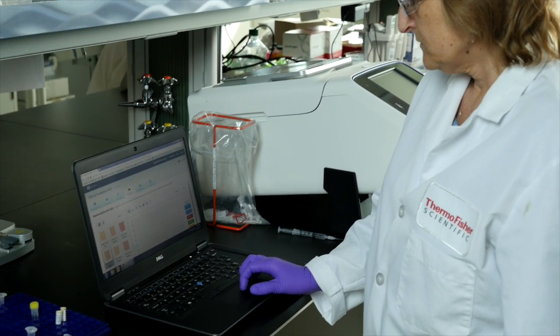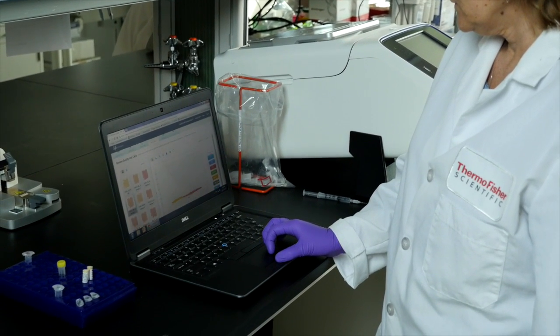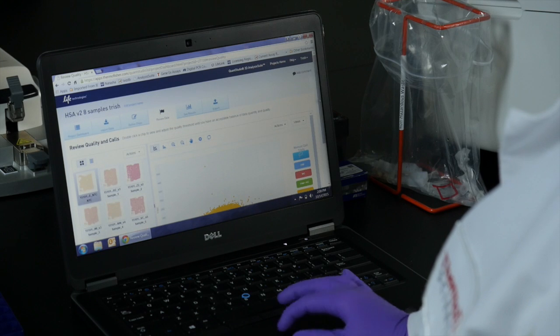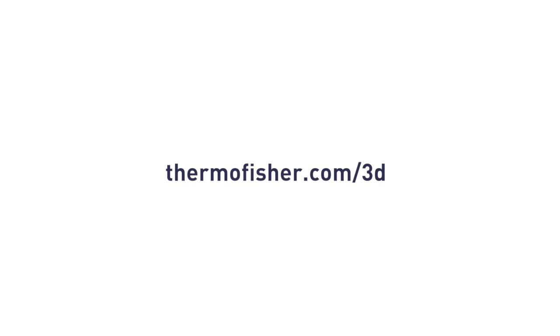Additional analysis and visualization can be performed using QuantStudio 3D analysis suite software. Visit www.thermofisher.com/QuantStudio3D to learn more about the entire digital PCR system and its applications.